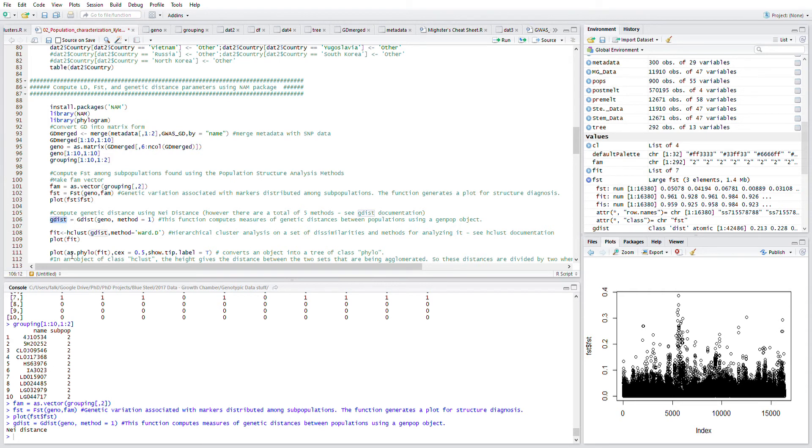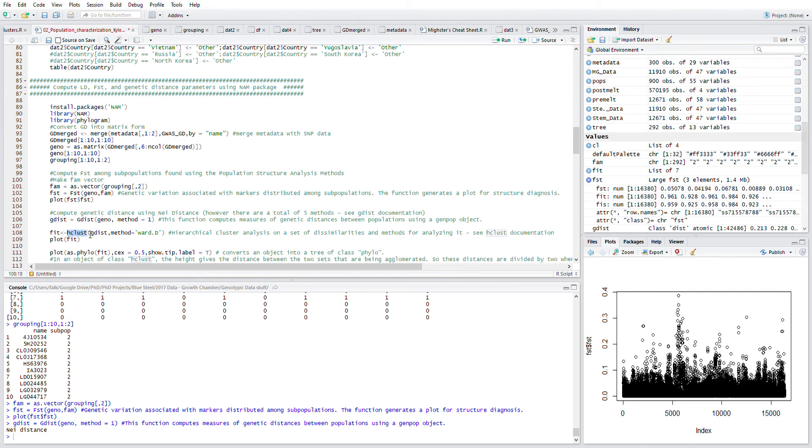We want to perform Ward's D clustering on that gdist. If you've done clustering in R, you'll be very familiar with this h cluster using Ward's D, or there are other methods like Pearson or Spearman, or whatever you want to utilize in your research.